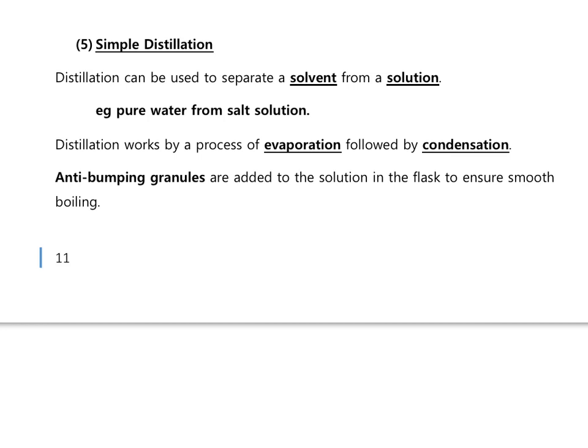The next separating technique we're going to look at is simple distillation. Again, something you should have met before in junior school. But distillation is a method that can be used to separate a solvent from a solution. Let's do a recap of our definitions again.